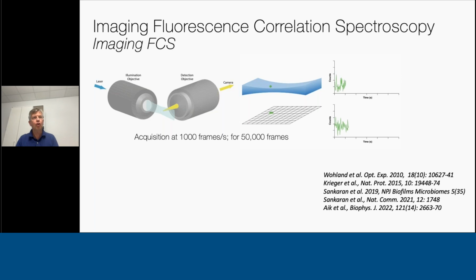Okay, so if you can record now so fast, what you can do now is take a look at single particles, and once they enter your light sheet, their signal is going to be imaged onto your detector. And on the right side, I give you two different examples of 2 pixels. If a particle is seen, you see that the intensity goes up. If the particle leaves a pixel, the intensity goes down again. So the width of these peaks tells you something about how fast particles move.